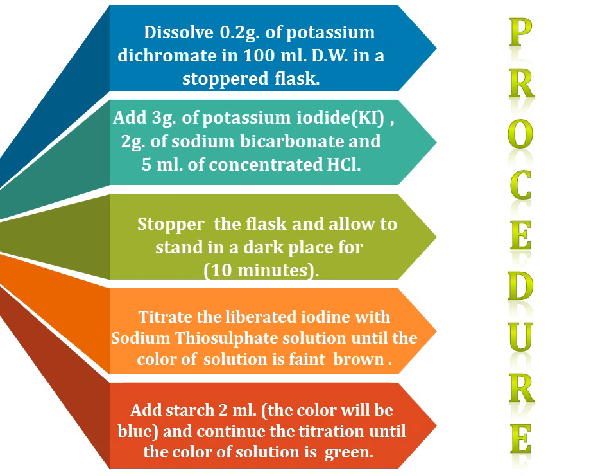Also, the starch must be freshly prepared, meaning prepared before doing the experiment, to prevent bacterial contamination.